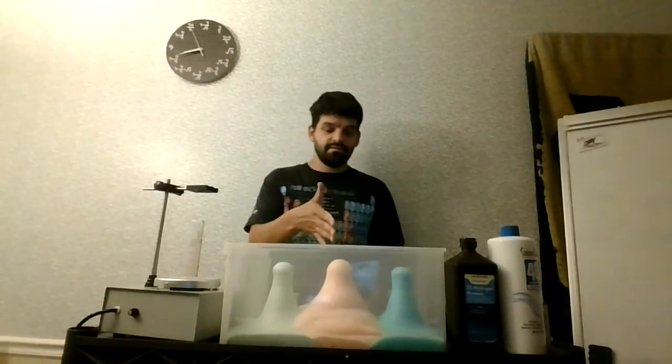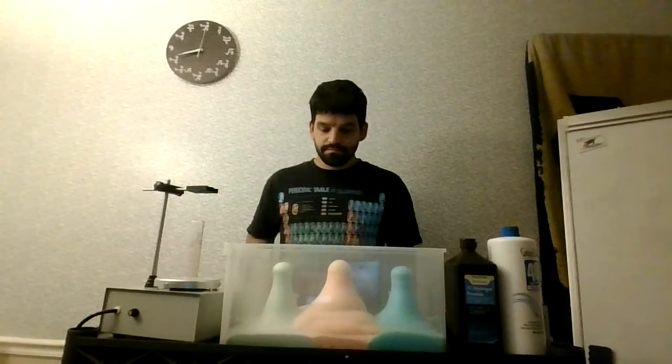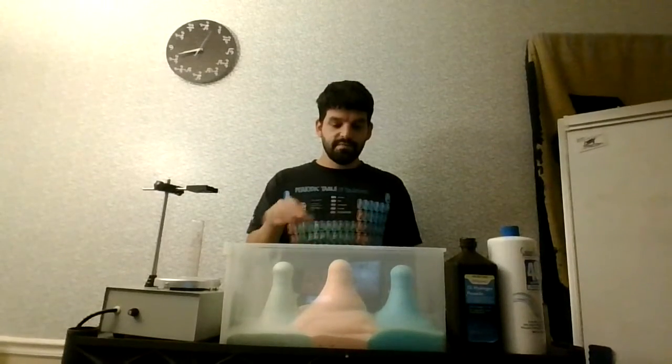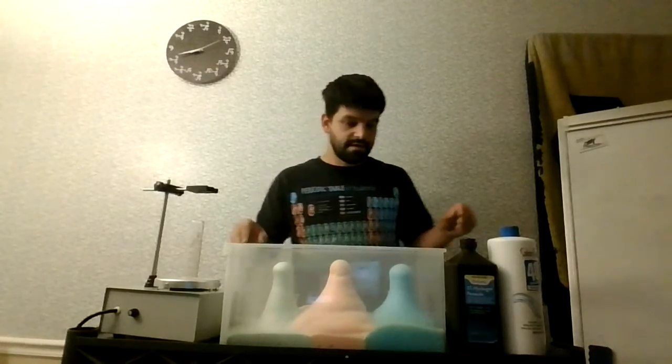But as you can see, the middle one probably had the biggest reaction, which was actually with the yeast, which is interesting. The foam is definitely being created here as a product. Let me see if I can zoom in here. The one on the right, on your right, is still going to town. You can see the bubbles. But from a volume perspective, the right one actually made a lot of foam. It just took a while to get the reaction started.